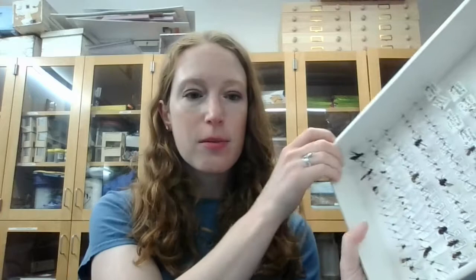So once they are in the trap, we can collect them. There's a little jar at the top of the trap. So we pull them out. They're all gunky from the fluid that they were in the jar. We wash them off and then we pin them.